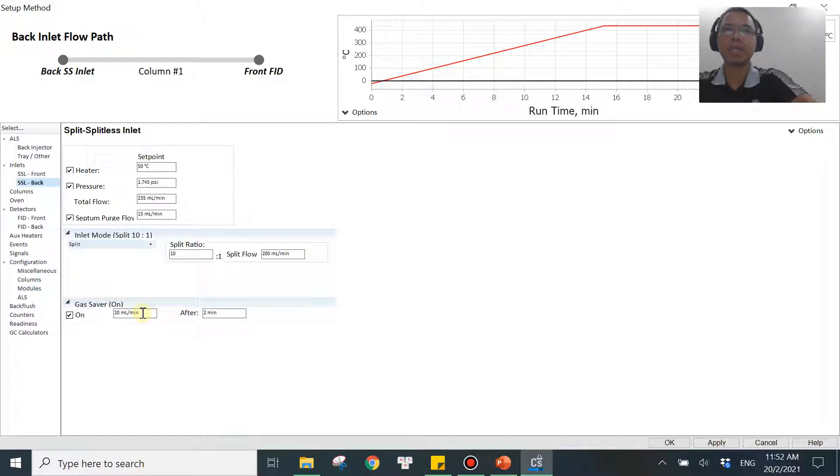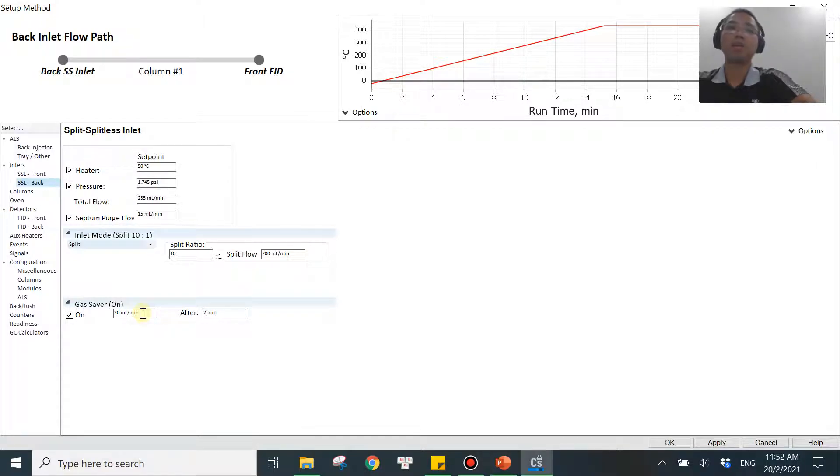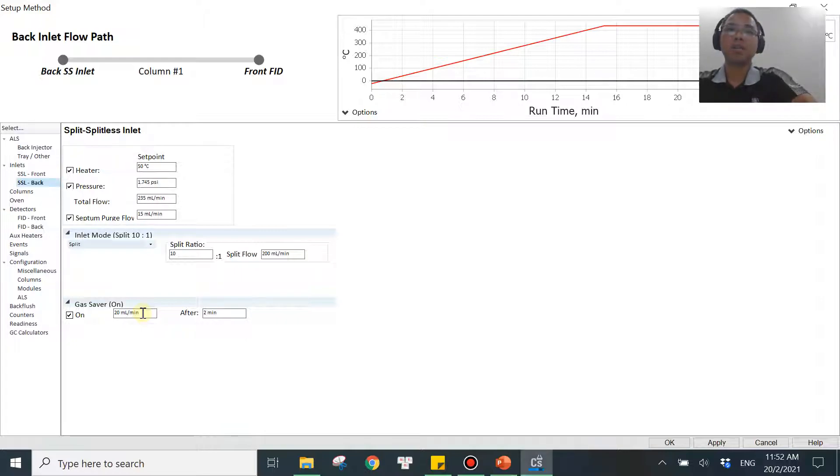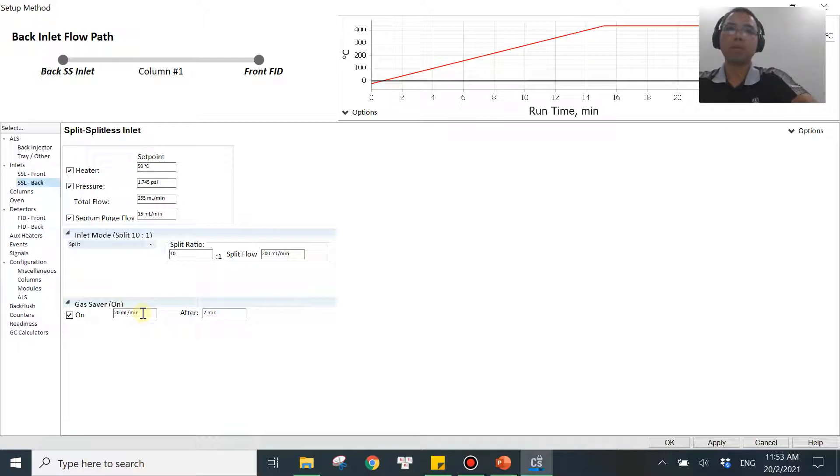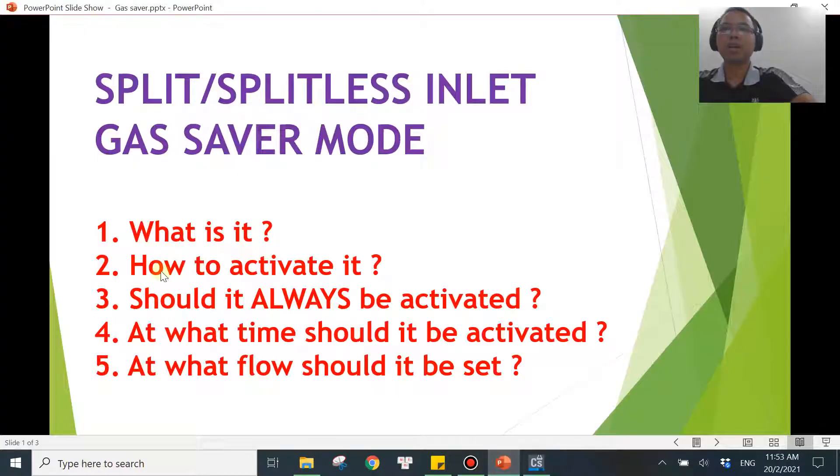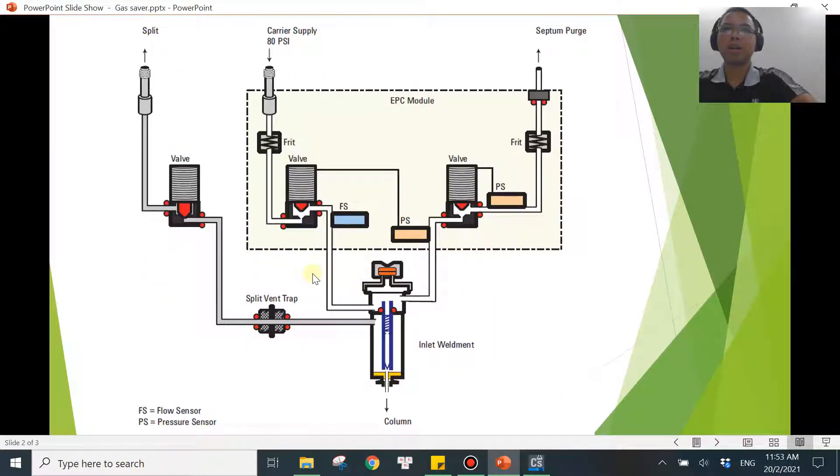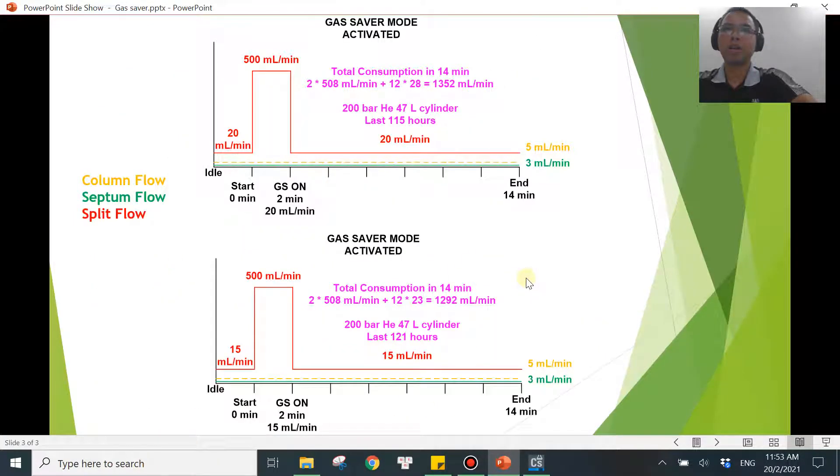But what about the maximum? Of course, you don't want to go so high. Because the main idea of gas saver is to save your gas. So if you go higher over here, that means you are not saving gas anymore. So there should be a number, and you should be going for the maximum, for the upper limit. So let me show you one example of that down here.